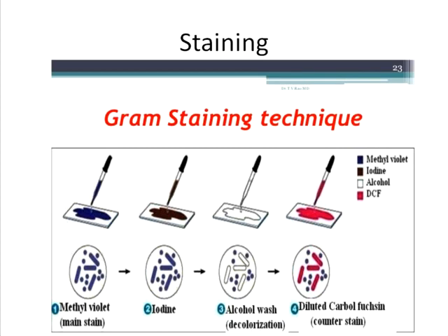Step 1 is the addition of a dye, and step 4, the last step, is also an addition of a dye, a stain we call in microbiological terms. The first dye is blue, violet in color. The last dye is pink in color.